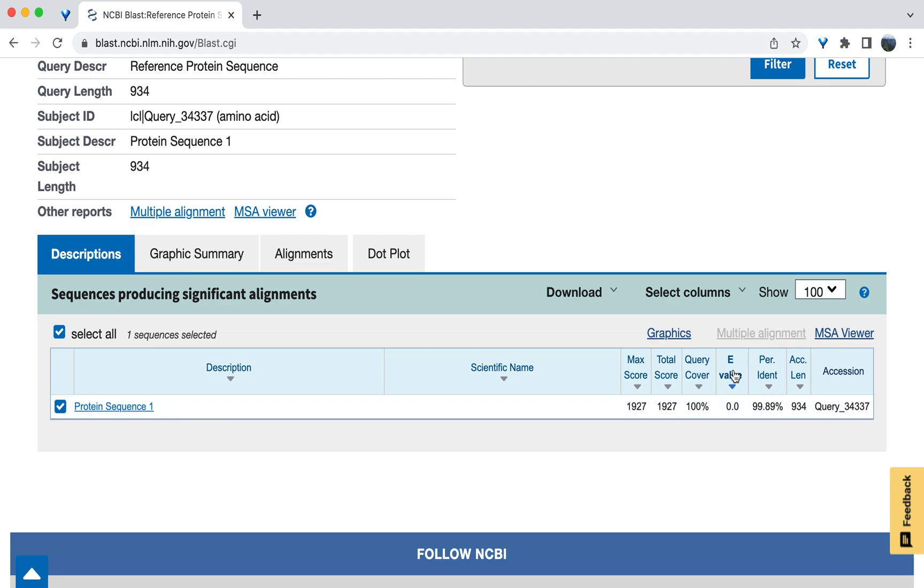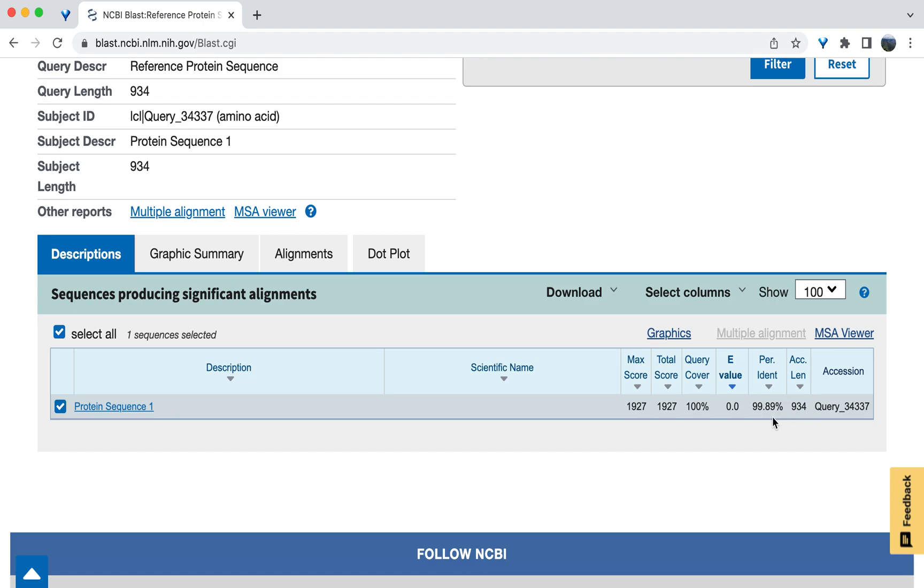Next, look at the percent identity, which is abbreviated here per-ident, which provides an indication of how similar the subject sequences are to the query sequence. More specifically, this value gives you a clue as to how many of the amino acids are the same between the two sequences. 100% indicates an exact match. We can see here that the percent identity is less than 100%, indicating there are differences between the two compared sequences.